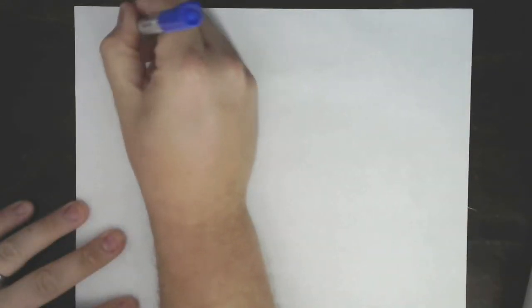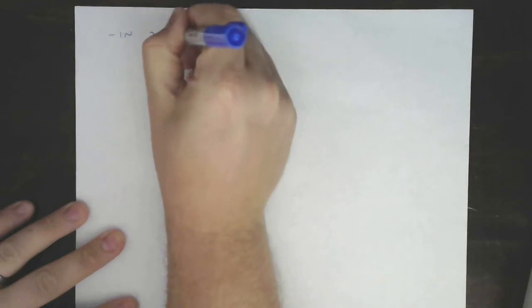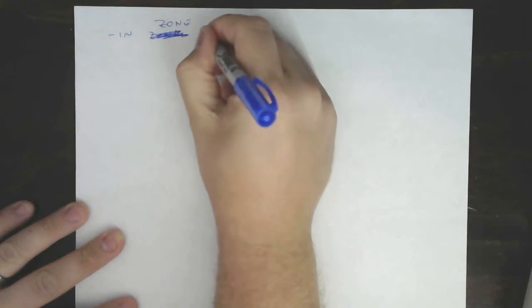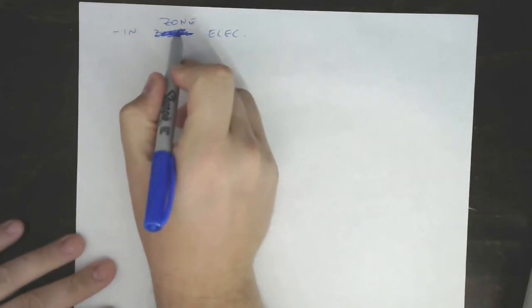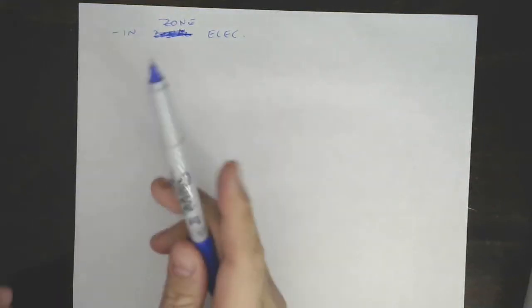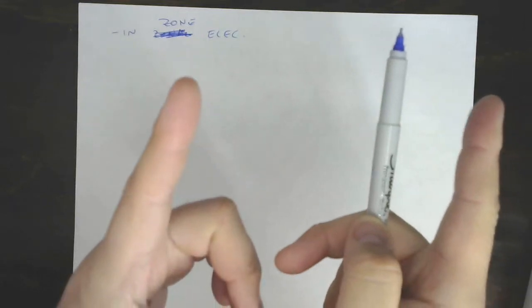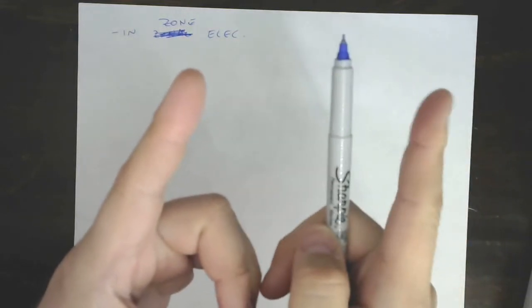And that is the type of capillary electrophoresis we've talked about is often referred to as zonal or zone electrophoresis. Zone electrophoresis just implies that the small injection plug is a zone in which sample exists, and we rely on different zones to migrate at different velocities, and we get 1, 2, 3 zones corresponding to 3 peaks. So it's just a little bit of terminology, zone, as a way of talking about separations of injected plugs where the plug is considered a zone.